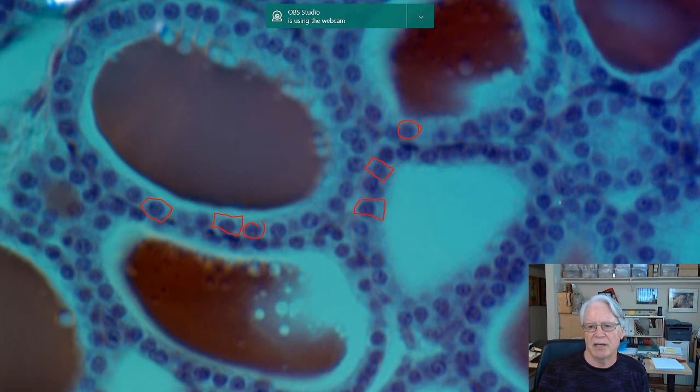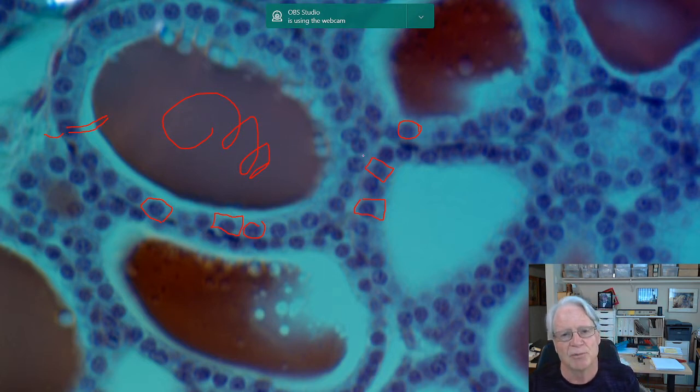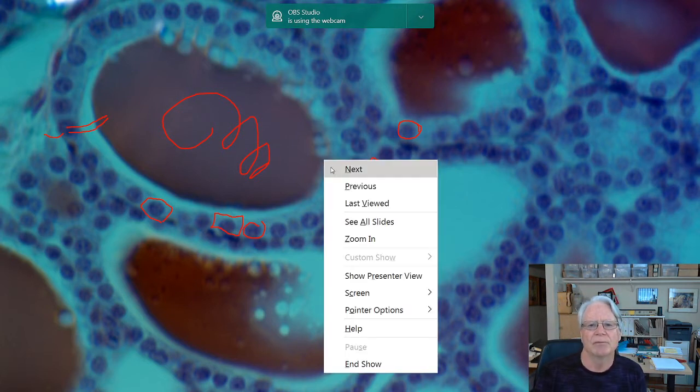So this is a gland, and it's producing thyroid hormones, and the chemistry is all taking place in here. As you'll learn, materials are coming into the cell, it produces a substance, secretes it into here, and in this space some more chemistry happens, and then it's taken back up into the cell, put into the blood as a finished product, a hormone. Okay.